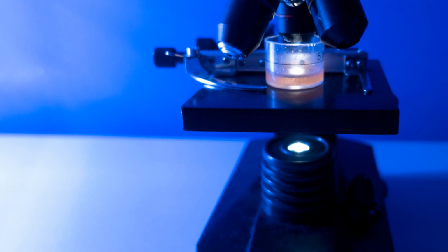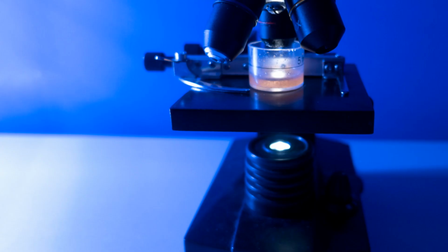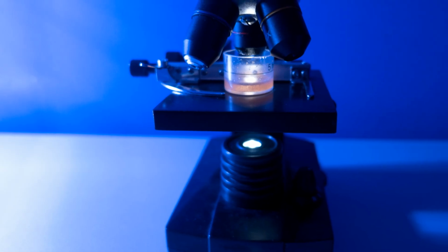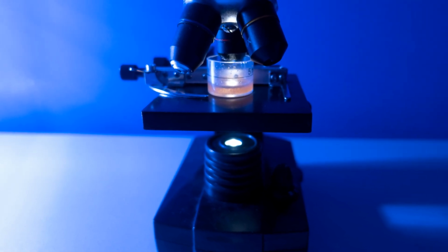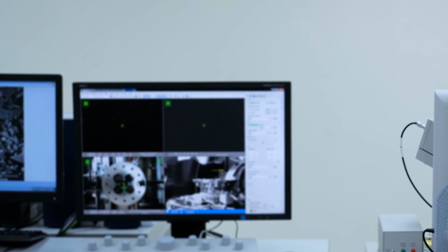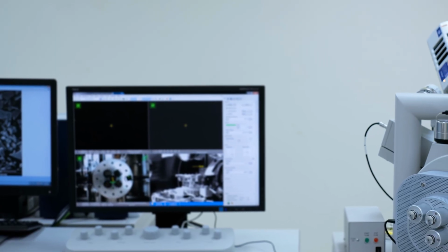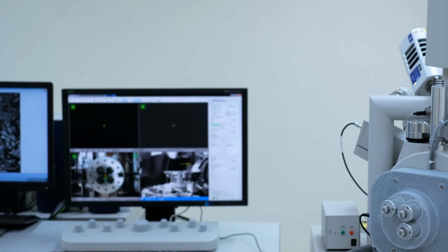It was a revolutionary moment. This invention opened the floodgates. Scientists could finally peer inside cells and see internal machinery in exquisite detail. Ernst Ruska later won the Nobel Prize in Physics in 1986. The scanning electron microscope followed. Early versions in the late 1930s, commercial availability in the 1960s. Scientists could now see surfaces in stunning three-dimensional detail.